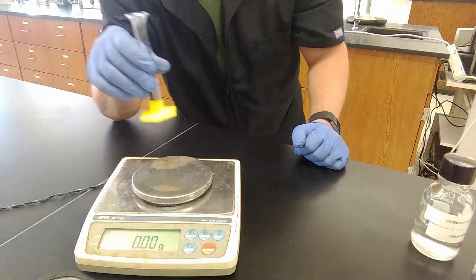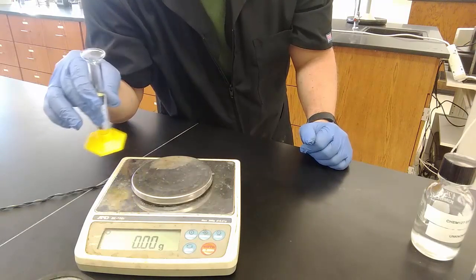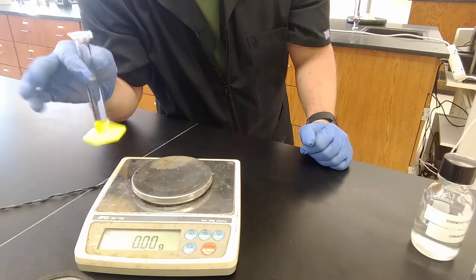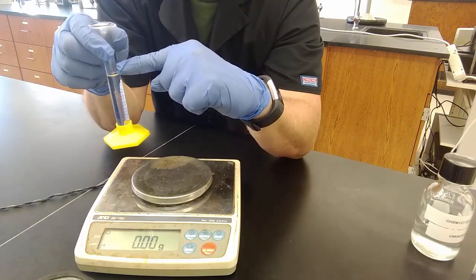So maybe this is some kind of alcohol. It might be drinking alcohol, it might be rubbing alcohol, it might be wood alcohol. So you would never take a snort of this and see what it is, because 10 milliliters, if this is wood alcohol, will permanently blind you. It's not a whole lot, it's a shot.